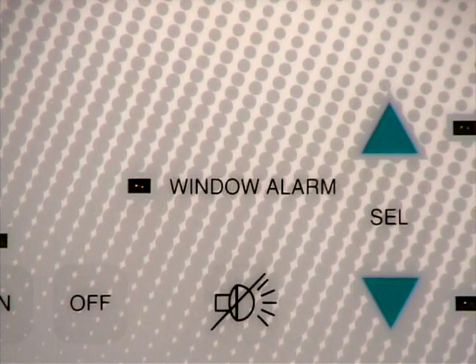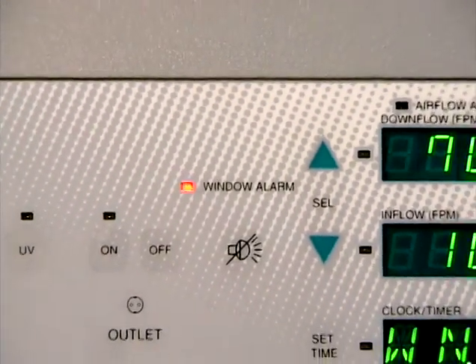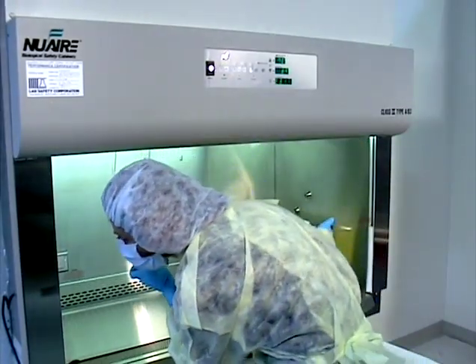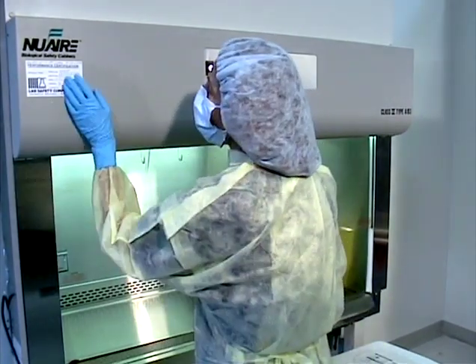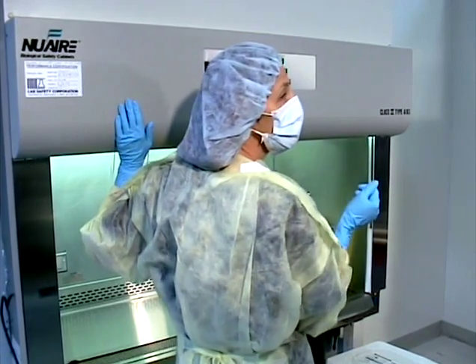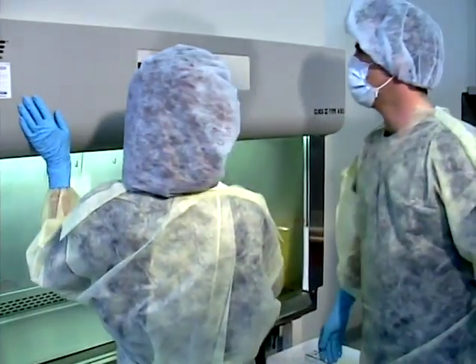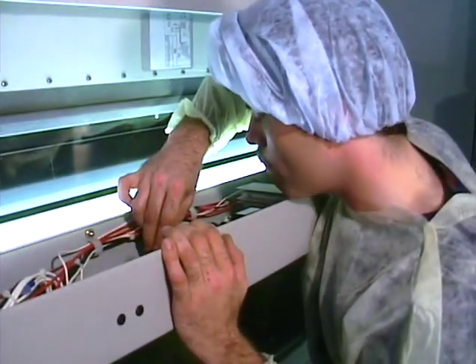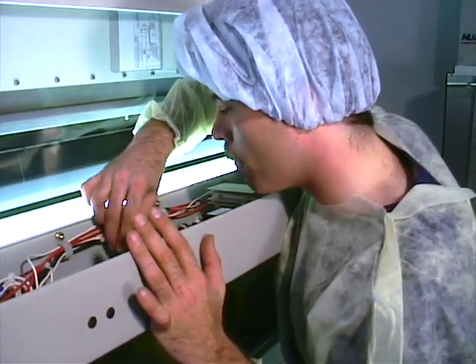Many biological safety cabinets are also equipped with alarms. If the alarm is sounding, verify that the sash is at the correct operating height. If the pressure monitoring equipment indicates operation outside the acceptable range, or the alarm sounds when the sash is properly adjusted, call a qualified professional to determine the cause of the problem and make the necessary repairs and adjustments. Under no circumstances whatsoever should the user attempt to repair or adjust any component of any laminar airflow device.